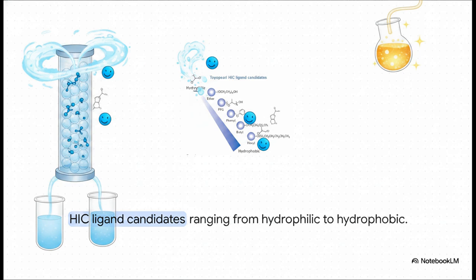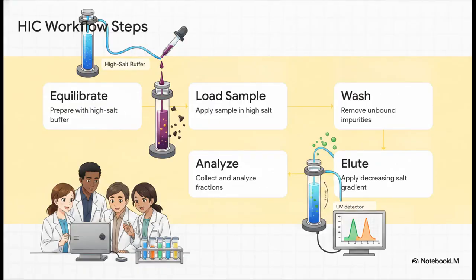For example, if you go with a weakly hydrophobic ligand, like an ether, you are going to need a much higher starting salt concentration just to force that protein to bind. Now, the actual day-to-day workflow in the lab follows 5 really distinct steps.